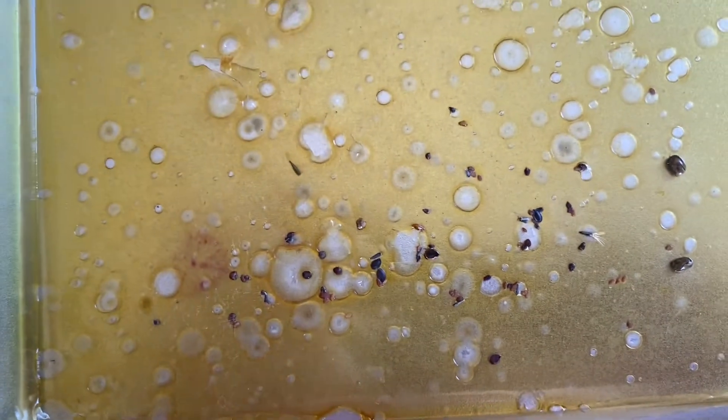The air bubbles happened because the glycerin didn't distribute properly in the mixture before it went to drying. So that's why air bubbles came.